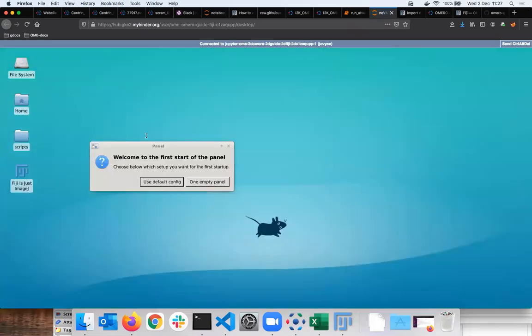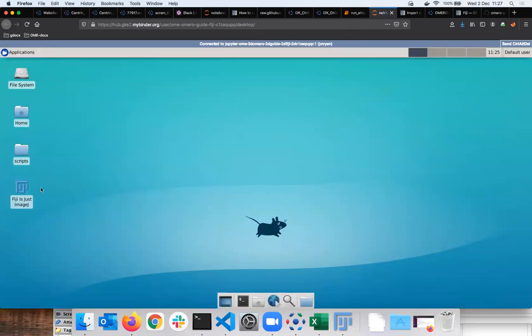So yeah, I think it's a nice way when you publish data. Sometimes people say, I analyzed my data with X, Y, and Z, and it's very hard for someone to be able to reproduce that analysis or even to set up the same environment. And I think that is what you can do in a public cloud-based infrastructure like Binder.